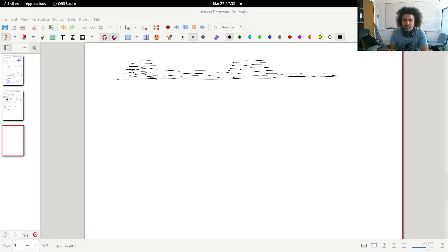So in the previous video we saw how we started from the shearing size, we identified the interesting regions, and then we analyzed them, the reads from the plus and the negative strand, and we got the fragment size.